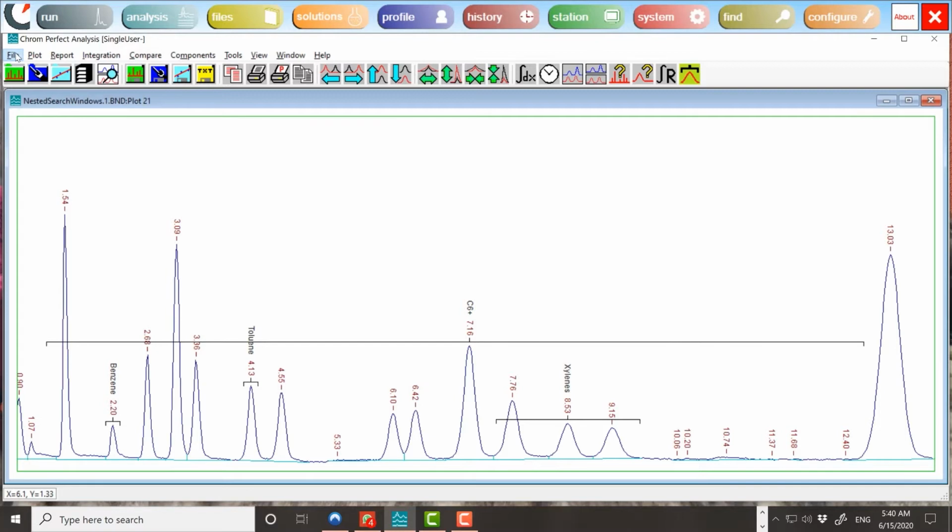When assigning peaks to search windows, the components are arranged in order of their search window widths, narrowest first. Each component gets to mark the peaks that lie within its search window. A component with a multi-peak window marks all the peaks that lie within its search window. A component with a normal single-peak window marks only its identified peak. Any other peaks within the search window are left marked as they are. Components respect previous marks. Since the smaller windows get to go first, their marks will not be overridden by later, wider windows. Therefore, peaks wind up under the narrowest window that may legitimately claim them.